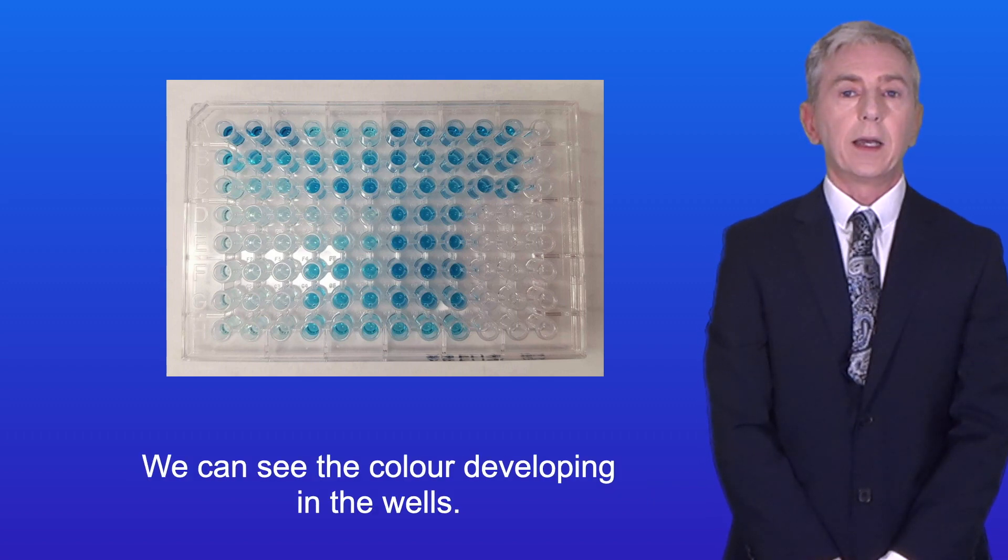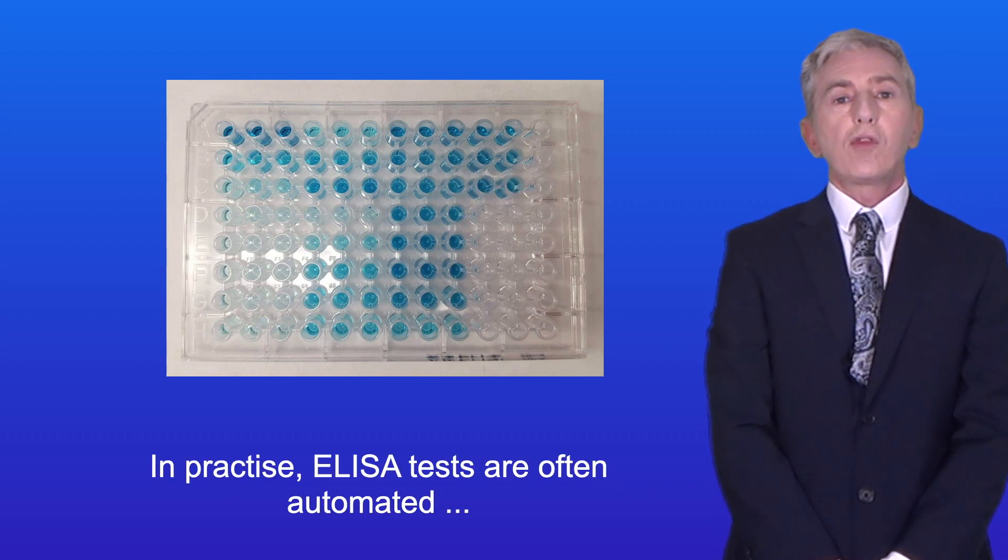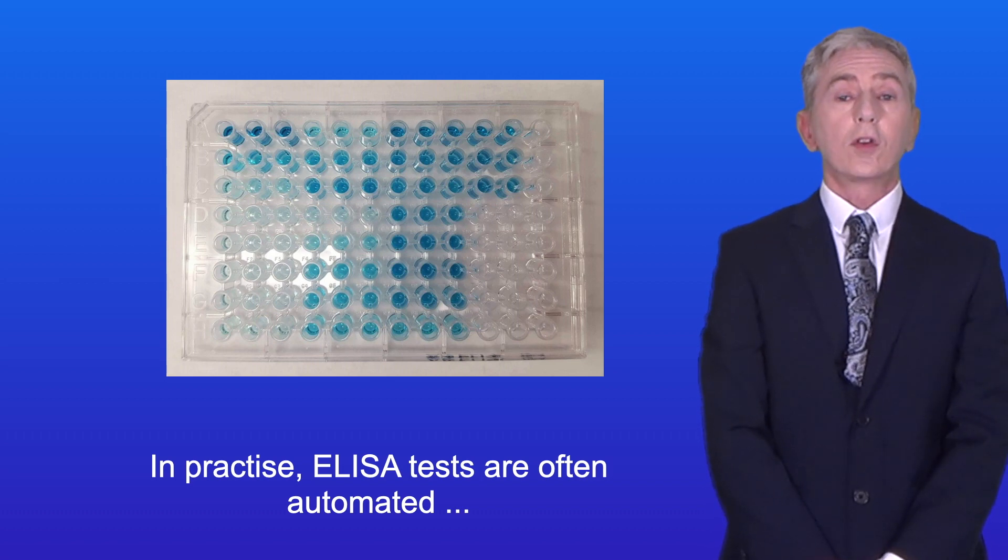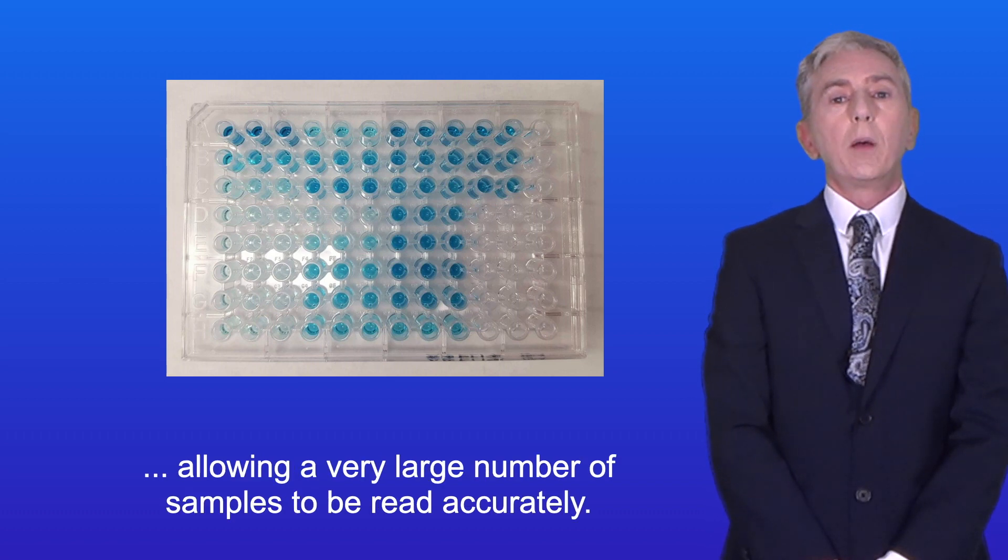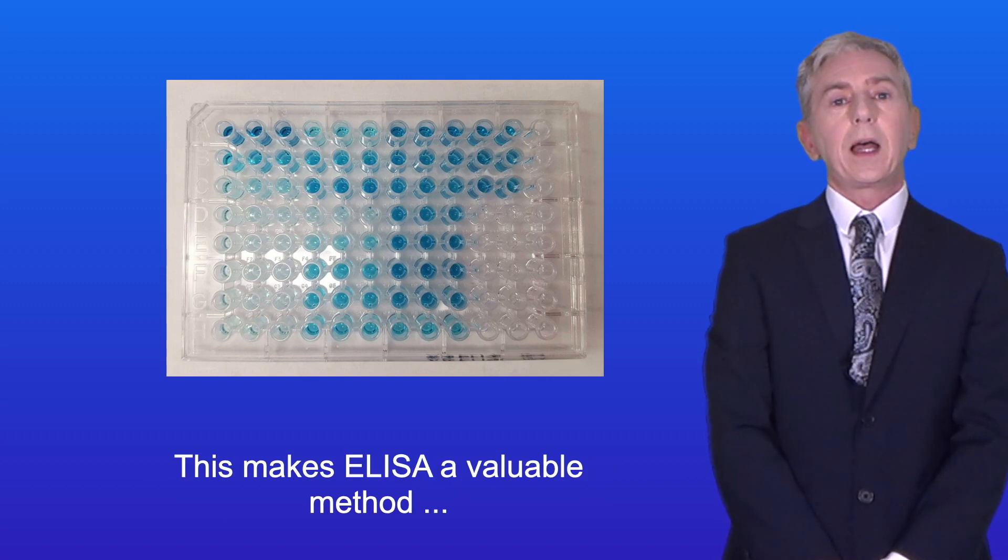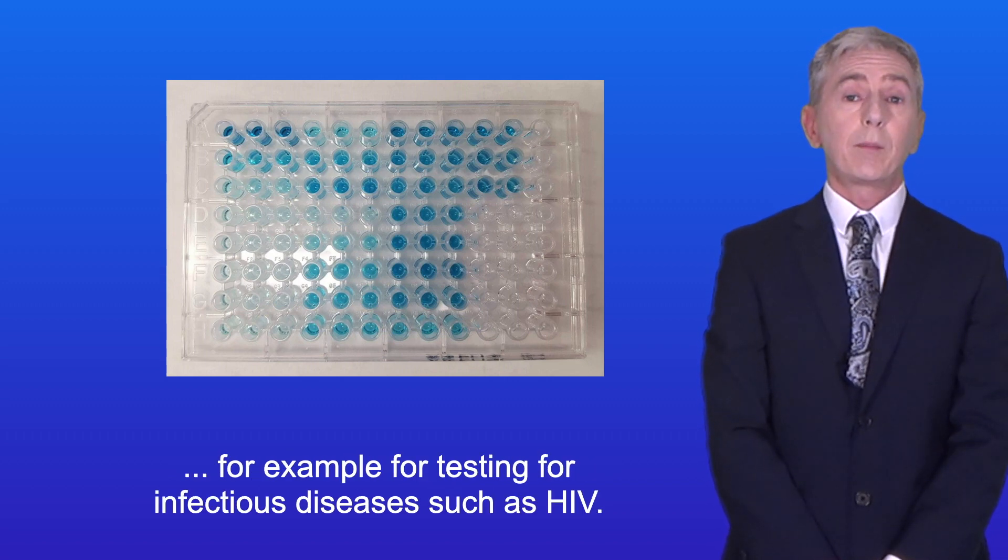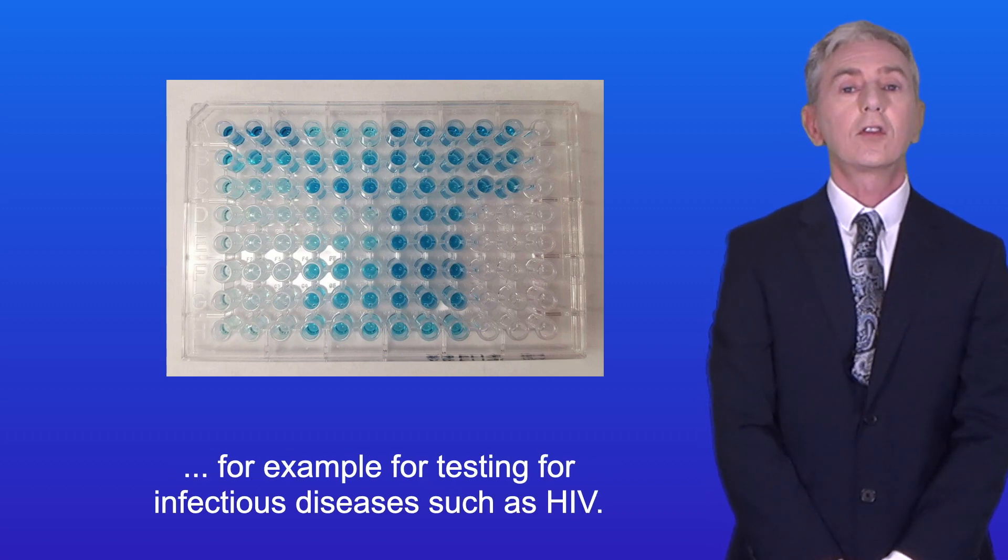I'm showing you an ELISA plate here, and we can see the color developing in the wells. Now in practice, ELISA tests are often automated, allowing a very large number of samples to be read accurately. This makes ELISA a valuable method, for example for testing for infectious diseases such as HIV.